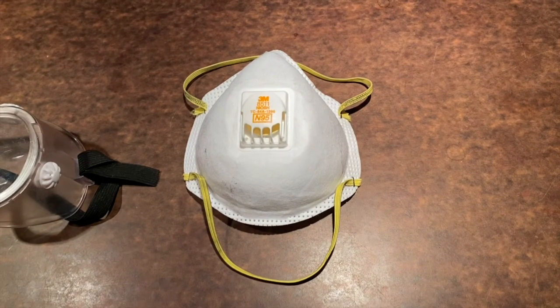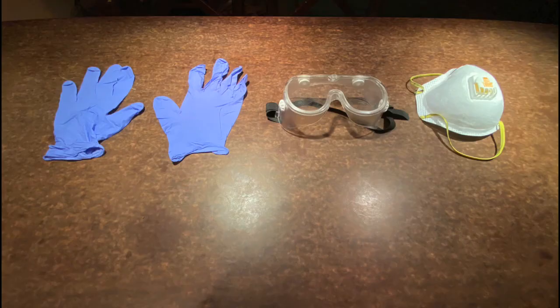You should probably use a mask dedicated to the experiment rather than your regular COVID mask, since if it becomes contaminated, it will need to be rinsed and dried before you can use it for its regular purpose. You want to put all of this on before you open up the container with the KOH, and keep it on until everything is disposed of or back in safe storage.